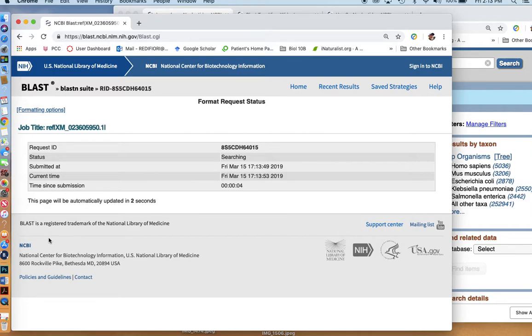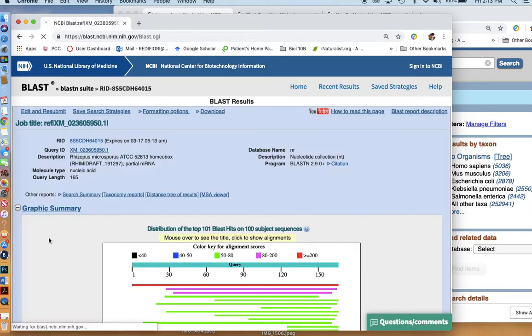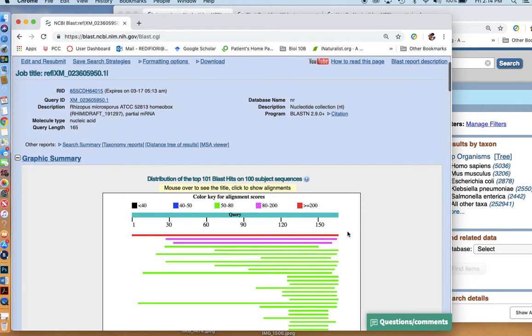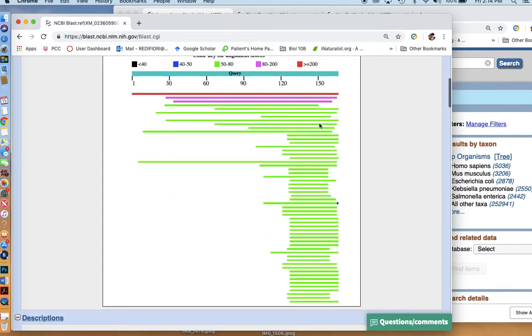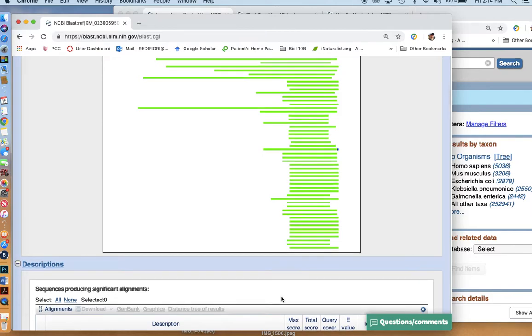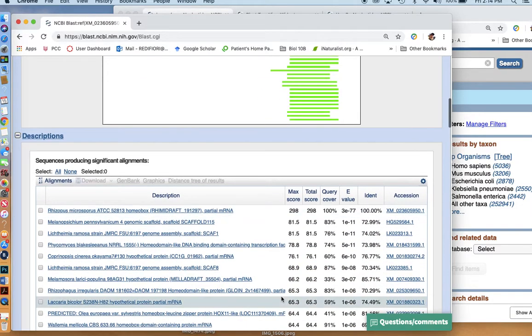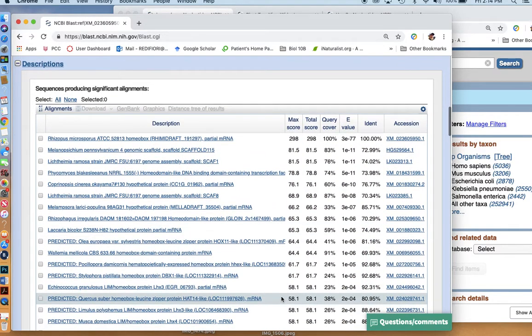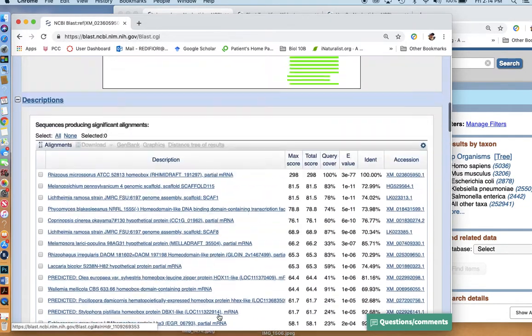Now, being a short section of a genome, so few base pairs, it's pretty easy to get a result pretty quick. So here we are. There's a portion of this that a lot of organisms have. So that's the conserved part of this gene that is likely to have been sort of an original segment.